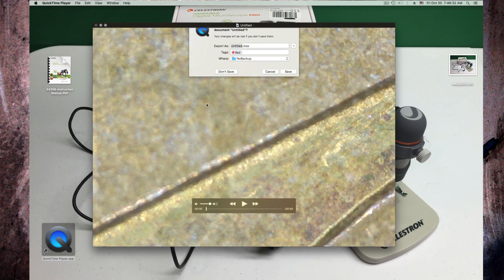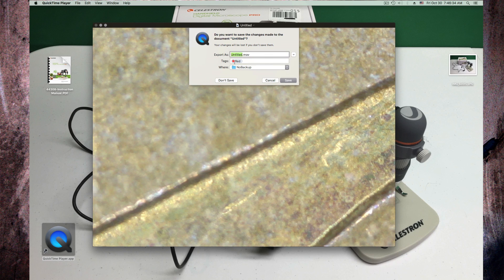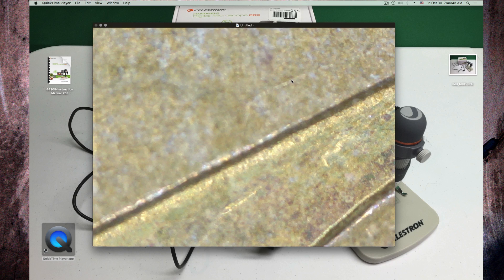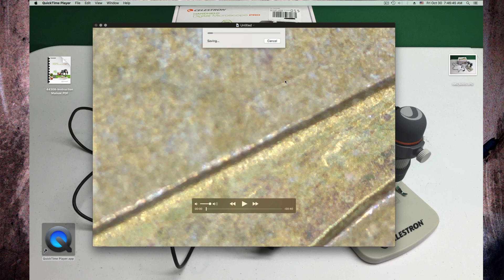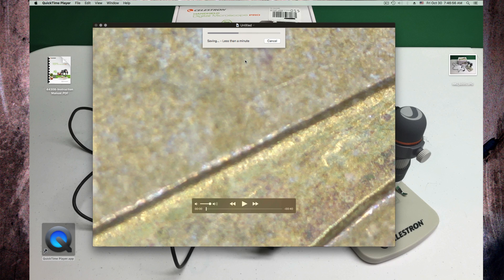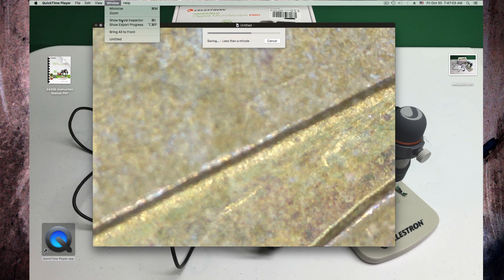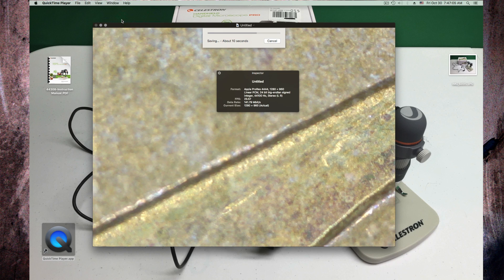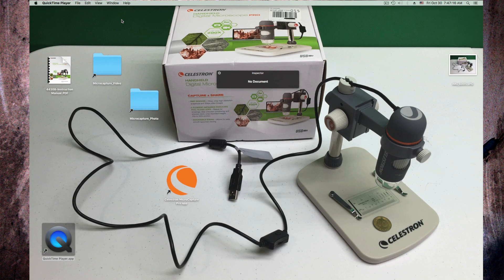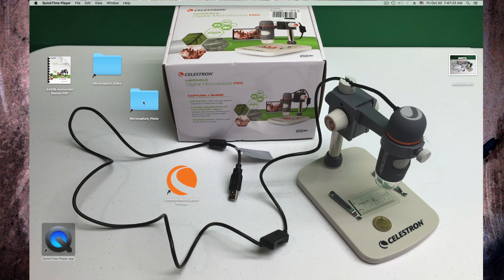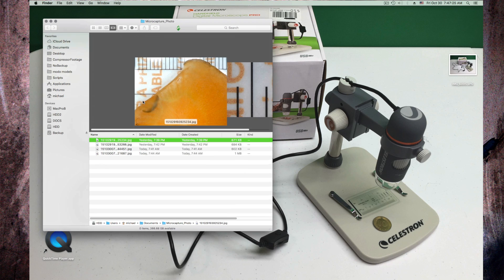This is like a big file now. And I'm doing this here. After it's saved, this is like almost a gigabyte from full resolution, 5 megapixel video, 30 frames per second. When this is over here and done, we can check the movie inspector. I don't know if it can do this. So this is how it recorded, 1280 by 960, with 24 frames per second. So that was saved.